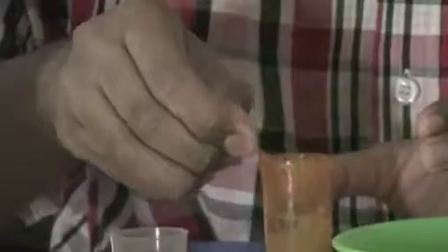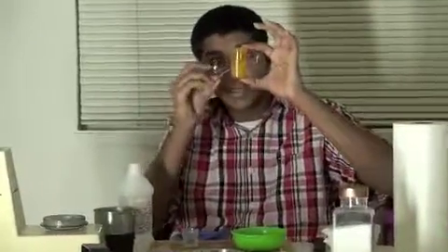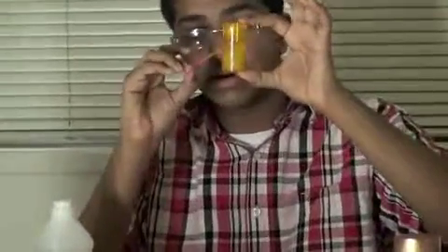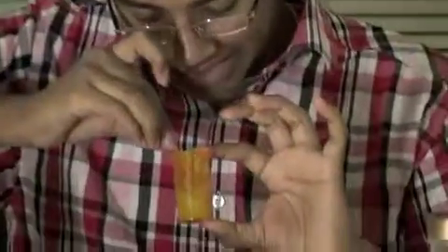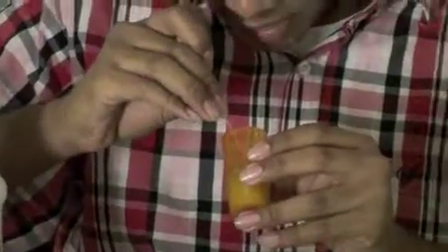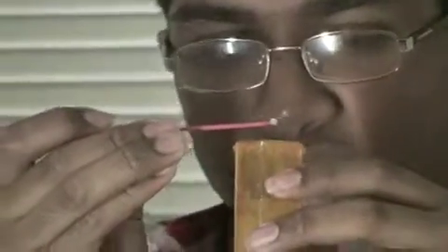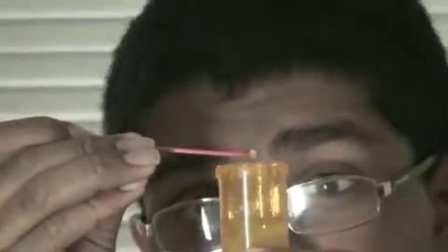Like Aditya described it, it's pretty much snot. It looks like snot. You see here? This part is where the DNA is suspended inside the alcohol. Compared to strawberry, this has a lot more DNA. For example, I'll show you just a small sample of where all of the DNA is. Here's just a small sample of it. As described, it's a snot-like substance, and all of the white stuff suspended in the alcohol is also DNA.